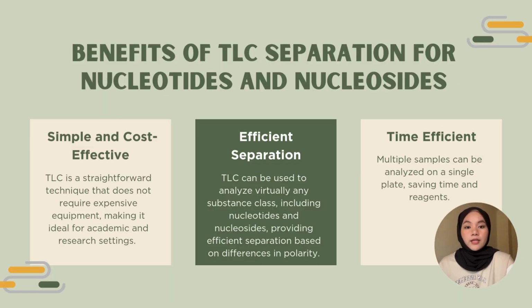Alright, now let's talk about the benefits of using TLC for this separation. The first benefit is simple and cost effective. TLC is an inexpensive and easy to use technique and it doesn't require costly equipment, making it ideal for educational labs or those with limited resources. The setup is straightforward and doesn't require highly specialized knowledge or training.